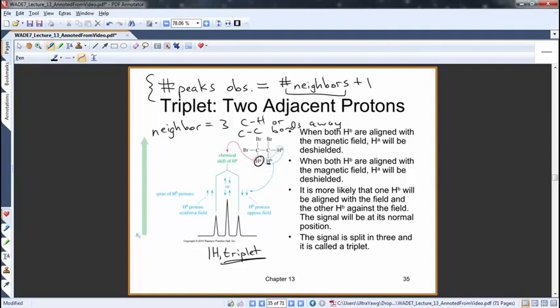If I go one, two, three, is this a hydrogen nucleus? No, it's a bromine, so that does not count as a neighbor. We're doing proton NMR spectroscopy here, so we don't care about bromines and stuff like that, at least insofar as counting neighbors. Now, if I'm talking about HB, I go three bonds away. If I'm talking about this guy, I go here, here, and here, one, two, three. Is that a hydrogen nucleus? Yes, so that counts as a neighbor.